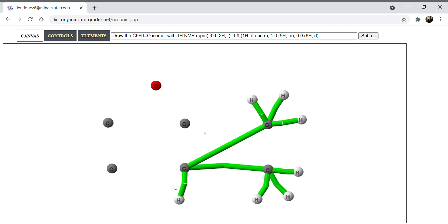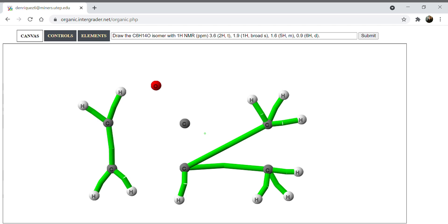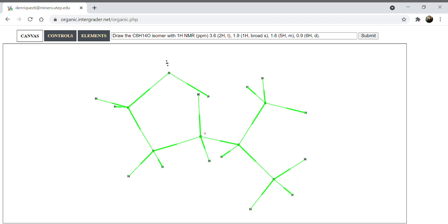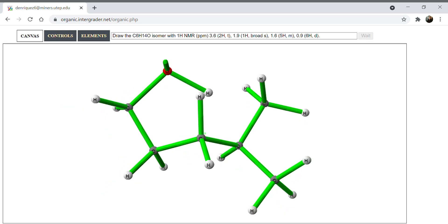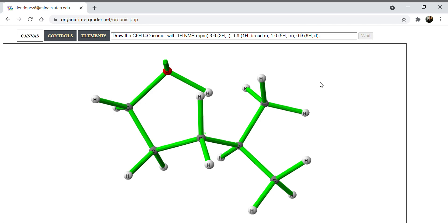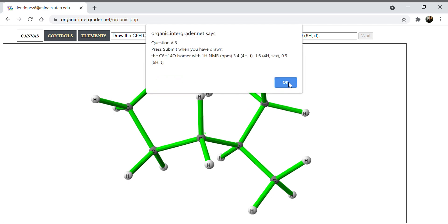The more bonds it has the easier it is to keep it like that. I'm going to jump up to the front: two hydrogens connected to a triple molecule, so I've got three atoms right here connected to that. Then more than likely one is going to be connected to the OH group, and then we have five H in the middle. This carbon is going to have two hydrogens, so I can connect all of them for a total of five hydrogens in the middle of the molecule. Lastly, add my hydrogens and electrons, hit arrange.